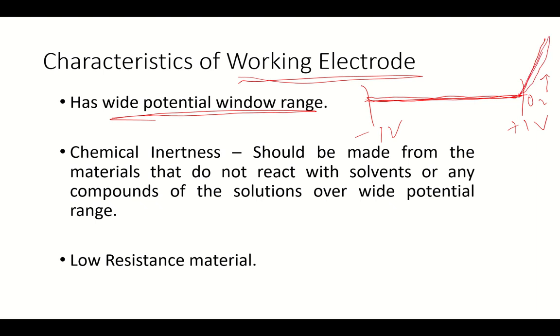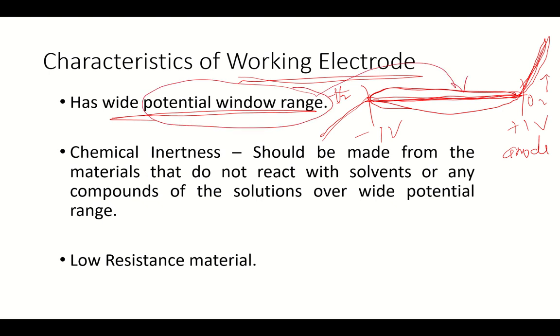When the working electrode acts as anode, this is the limit of oxygen evolution. When it acts as cathode, the opposite, hydrogen evolution, you will see bubbles on the working electrode. So this is where it is clear, there is no current from active species present. This is called the potential window range. This region is suitable for measuring active species. This side is the oxygen evolution, OER, and this side is HER, hydrogen evolution.